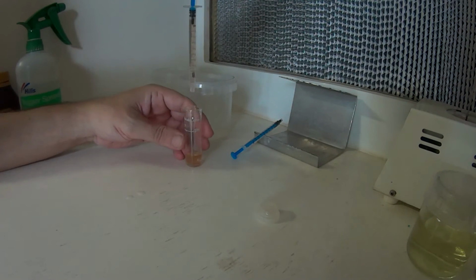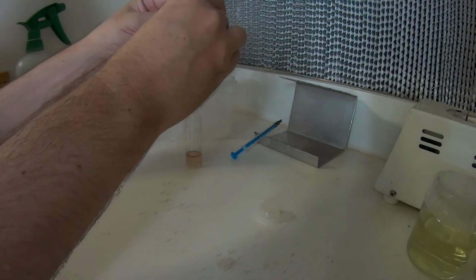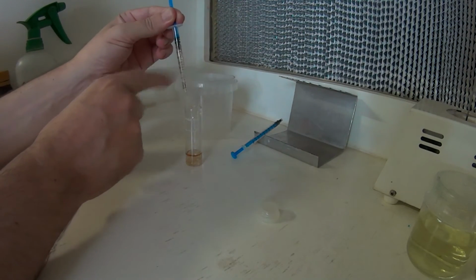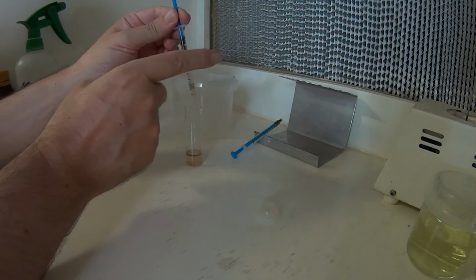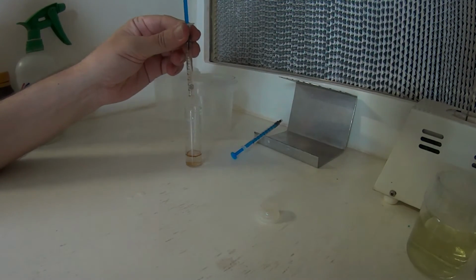Now the key to this is because that seed will float, it'll rise up into the top of the syringe. Now as we go, we can just give it a little bit of a tap and slowly let all the seed, or the majority of it, float to the surface, so we can reduce some of the hydrogen peroxide in here just by squirting it back into the container as we go.